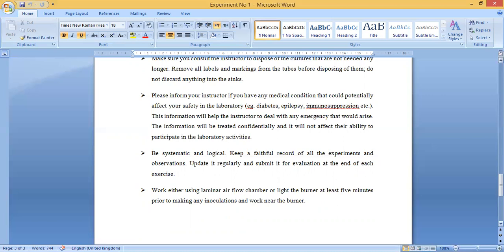Be systematic and logical. Keep a faithful record of all experiments and observations — whatever you observe, note it in your notebook. Update it regularly and submit for evaluation at the end of each exercise. Work using a laminar airflow chamber or light burner at least five minutes prior to making any inoculation, and work near the burner.